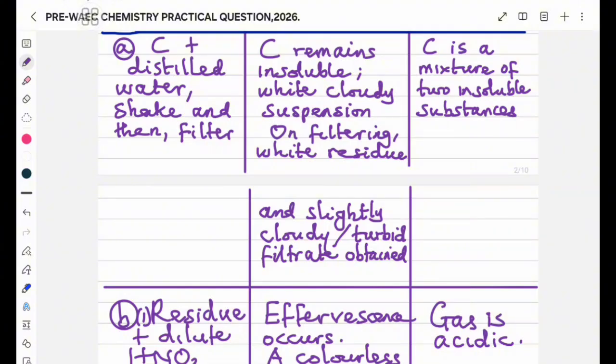Number 4 that I wanted to take note of is that the filtrate is usually clear or slightly cloudy. The filtrate is slightly cloudy water, and that's due to the presence of some particles of starch that are present in the water. So the filtrate becomes cloudy because of the tiny particles of starch that pass through the filter paper with the water.